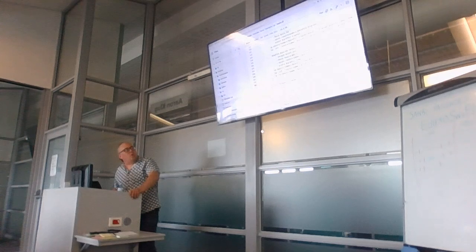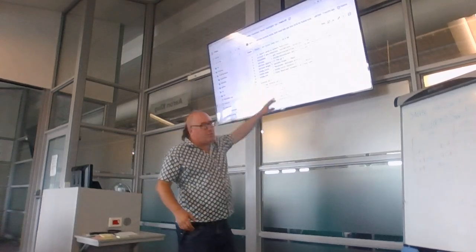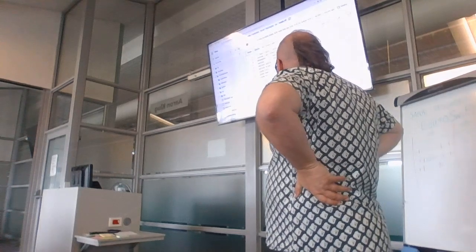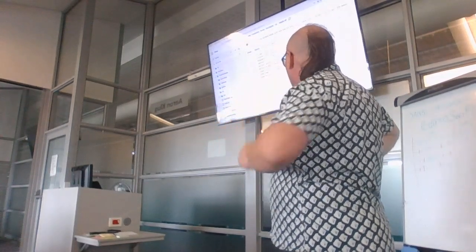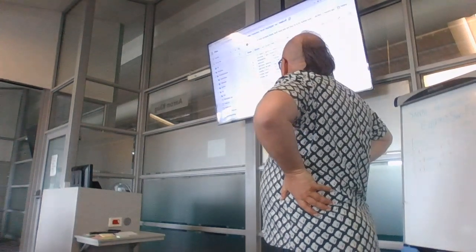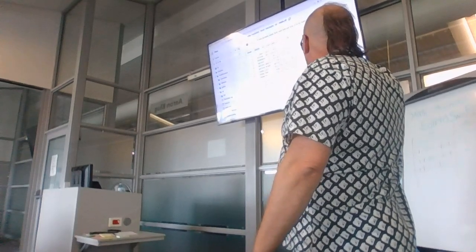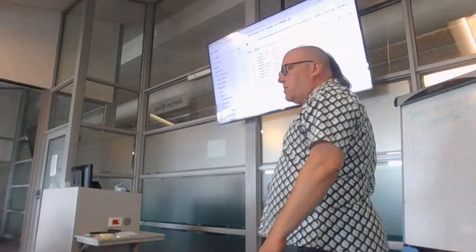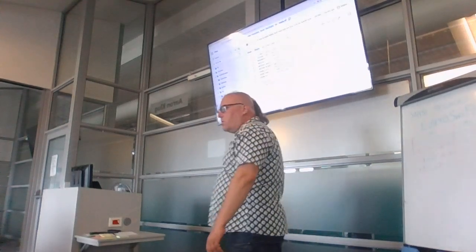So, where did it get the software from? Okay? At the top here, it says two things in the process. I don't think you've seen this yet in Nextflow, but I can't remember. Lines 15 and 16, okay? It's either using Conda, okay? Or it's using containers, okay? And if it's using Conda, it will create the Conda environment which is defined up here somewhere in line 9. It will create a Conda environment with the tools that you need. And if you're using containers, it will let you either use Singularity or Docker containers, okay?